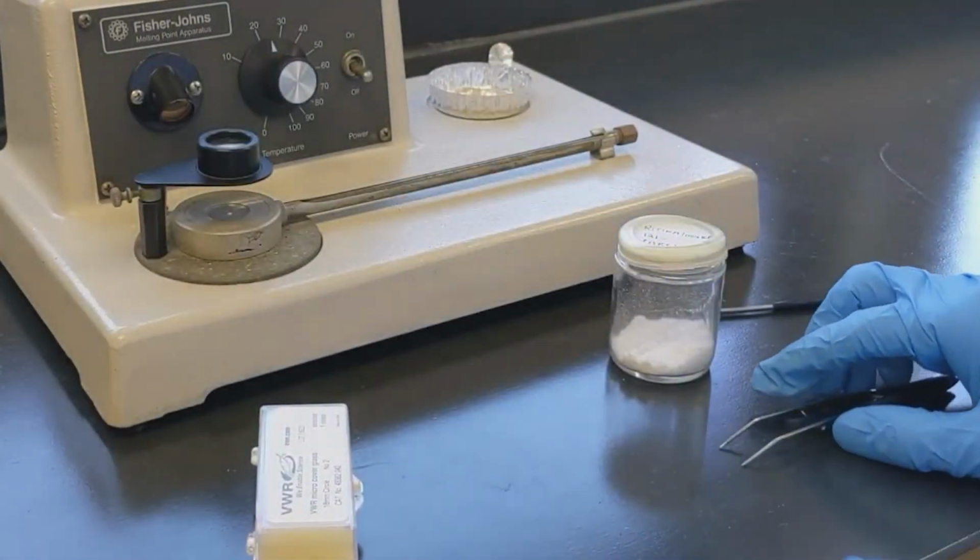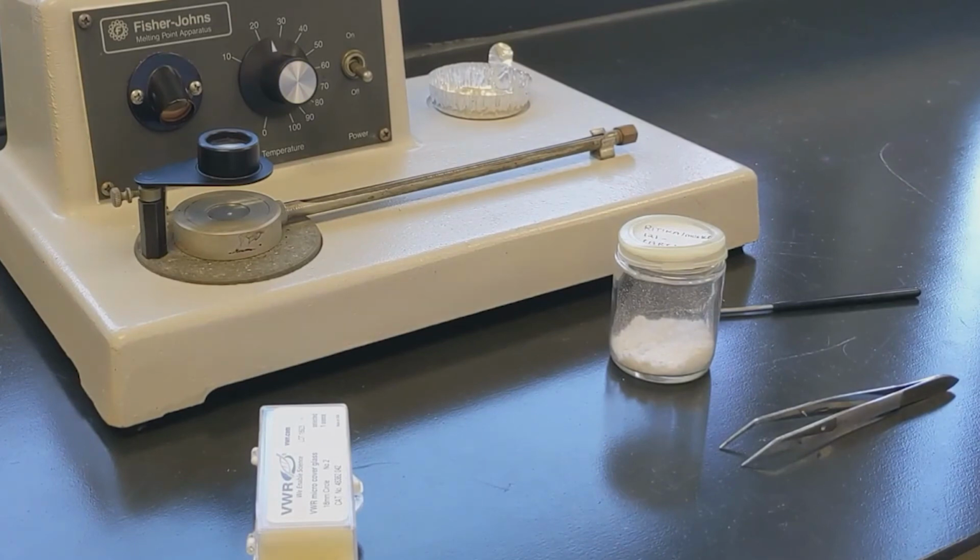These cover slips can be disposed of in a waste beaker or aluminum pan that is nearby. Never use the tweezers to transfer the crystals.